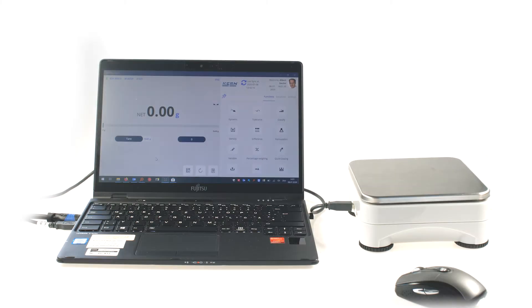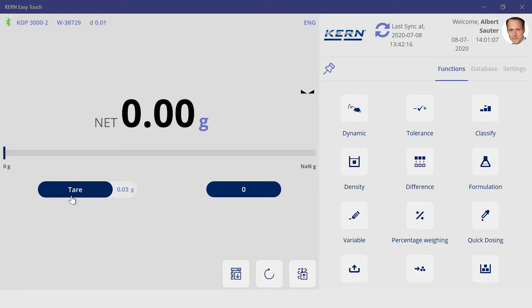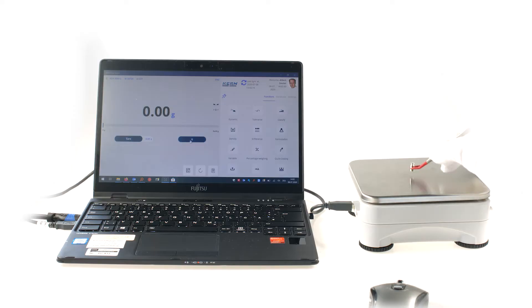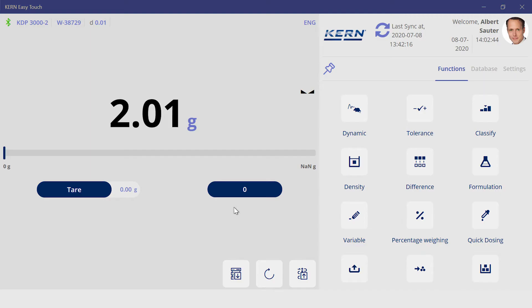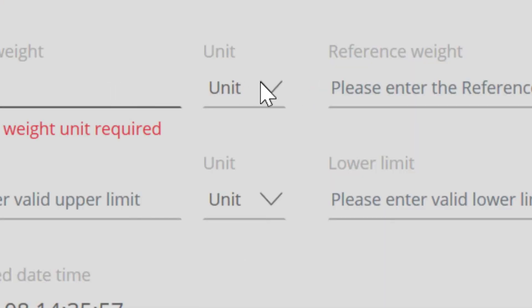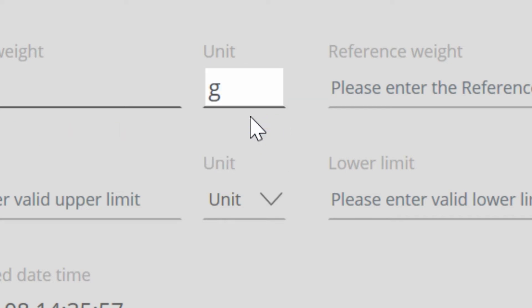Even the basic licence includes all basic weighing functions such as the weighing itself as well as tarring, zeroing, or the selection of weighing units such as grams, kilograms, or carat.